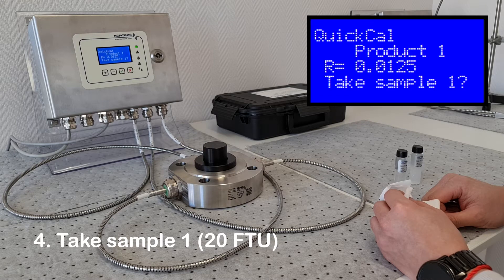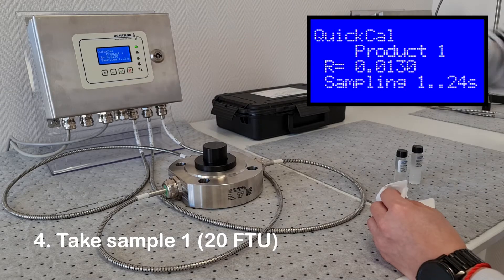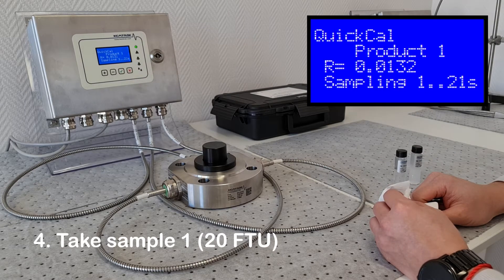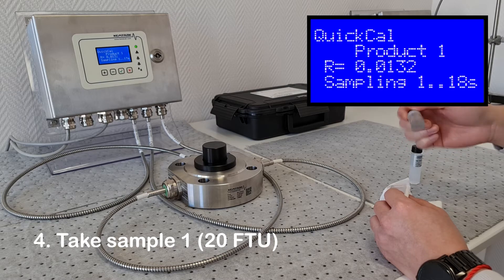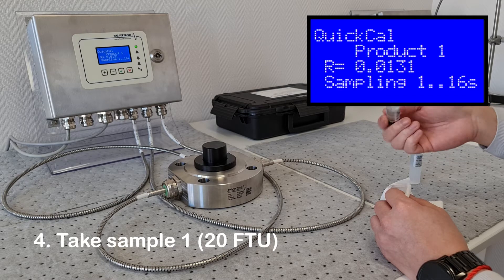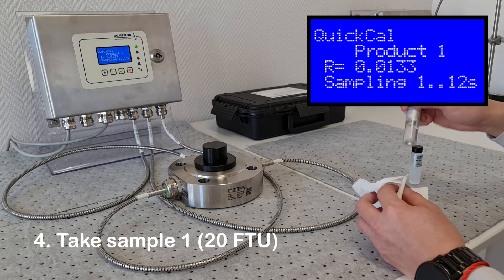Wait a couple of seconds for the signal to stabilize, then press tick to begin sampling. To ensure a good measurement, the analyzer samples 20 seconds of readings. During this time, you can start inverting the next calibration standard, which will be 100 FTU.